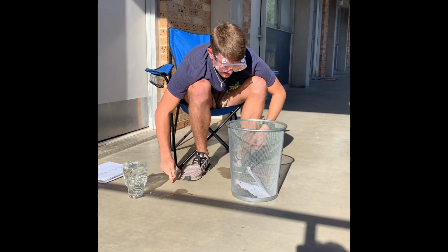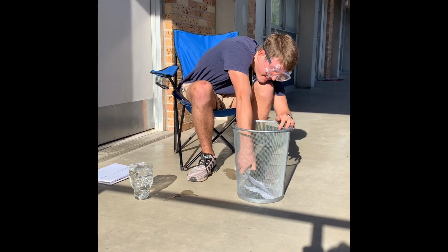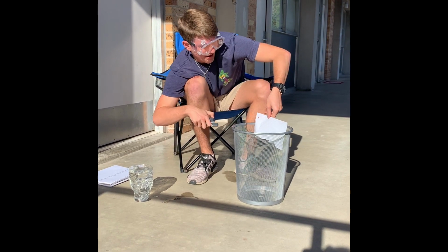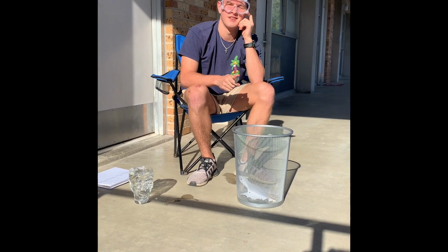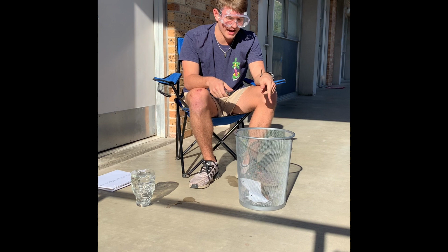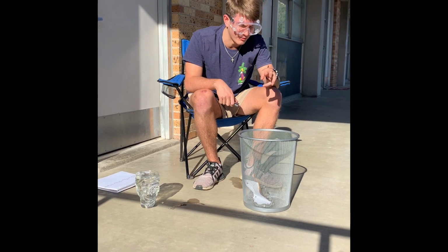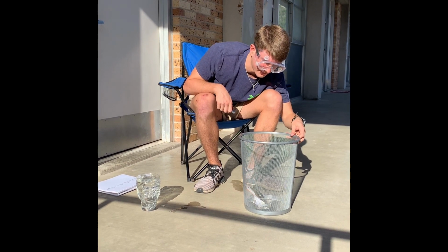All right, as you can see, the fire is reacting with O2 in the air. And it is producing ash from the paper, and H2O gas, CO2 gas, and it's breaking bonds and actually changing the properties of the paper. So the boiling point's changed, melting point's changed, and a ton of other different chemical properties are changing.